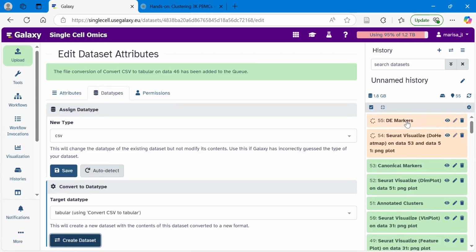So it's a little bit convoluted, but sometimes you just have to change your data set a little bit to get it into the form that you can use to create a plot or do a particular type of job on it.